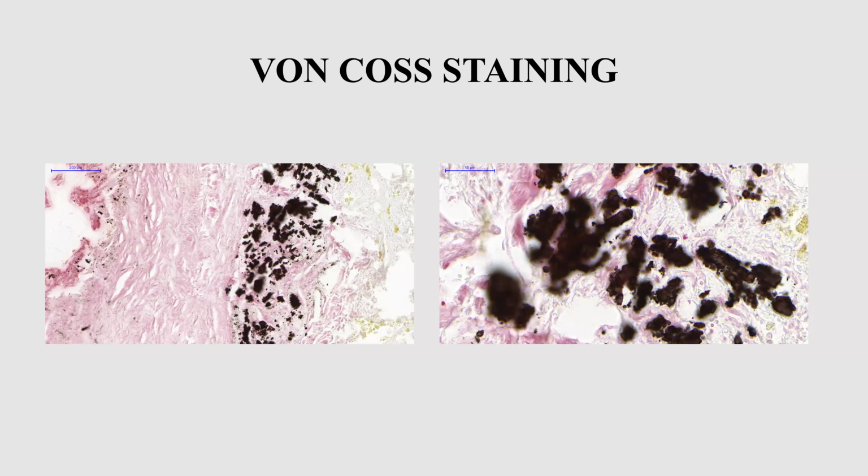This method is based on silver, using silver nitrate. We know from chemistry that silver nitrate is soluble, but under some reaction it uses light, from simple light like we use in rooms in our offices, under a lamp.